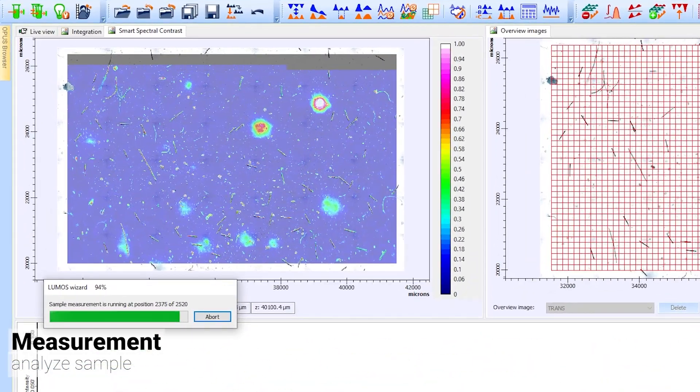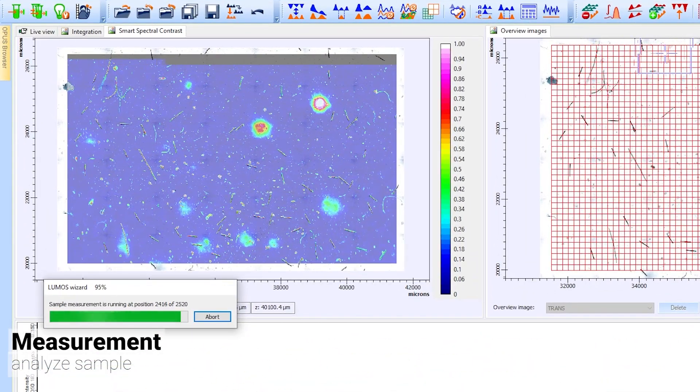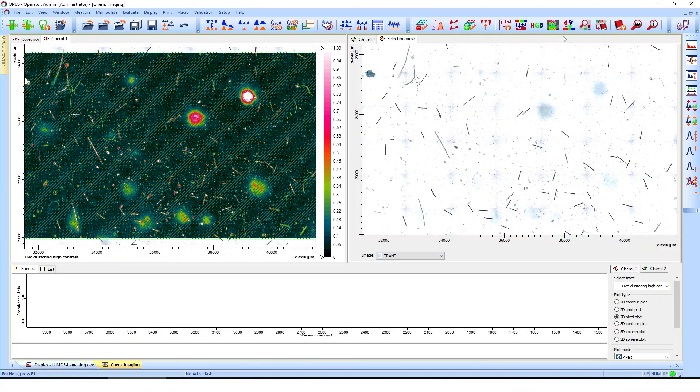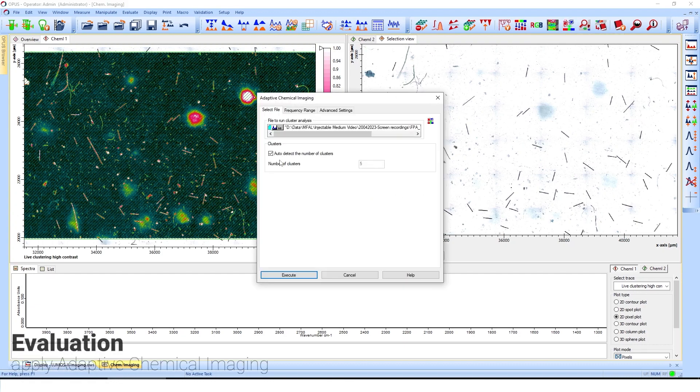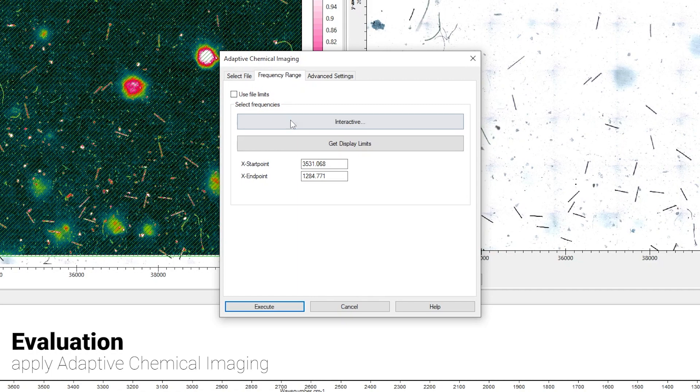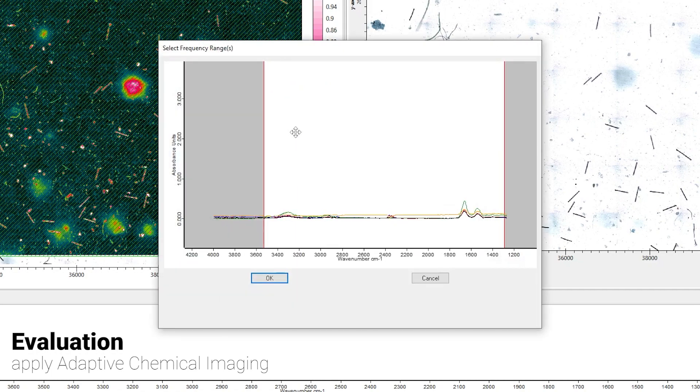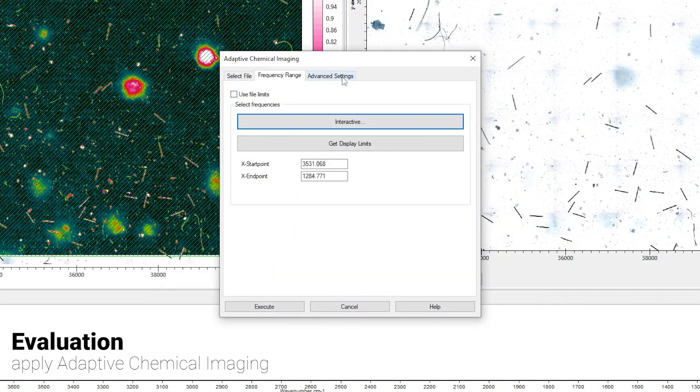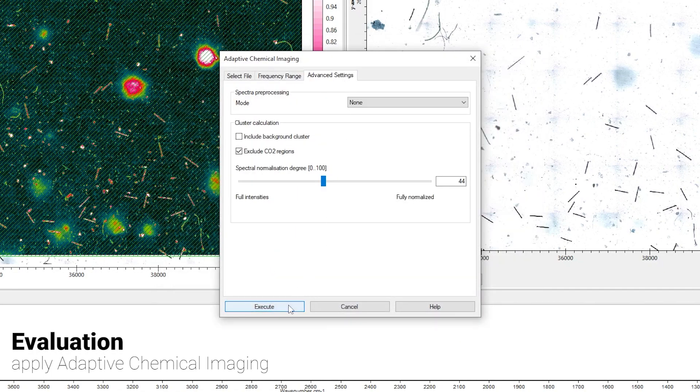Already, we can see particles popping up in bright colors. But it's not just the measurement that's getting smarter, the evaluation is too. Applying Bruker's AI-based adaptive chemical imaging will evaluate the complete sample area with a single click. It autonomously classifies IR spectra, making it easy to detect particulates or other contaminations.